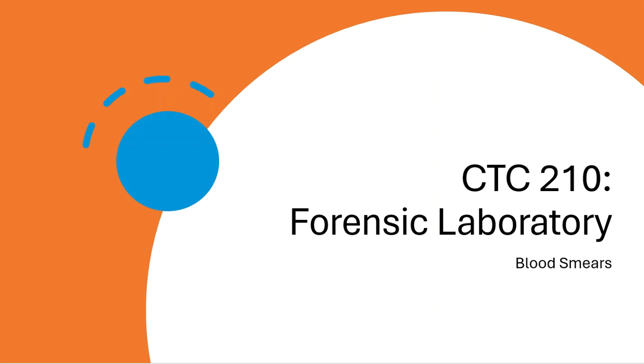I'm then going to switch the magnification of the microscope for 3 different settings. And then in the software, I'm going to show you how you go through and take a picture of the image that is showing up with our microscope camera. So you're going to learn a little bit about the microscope, and you're also going to learn a little bit about the software that makes the thing operate.